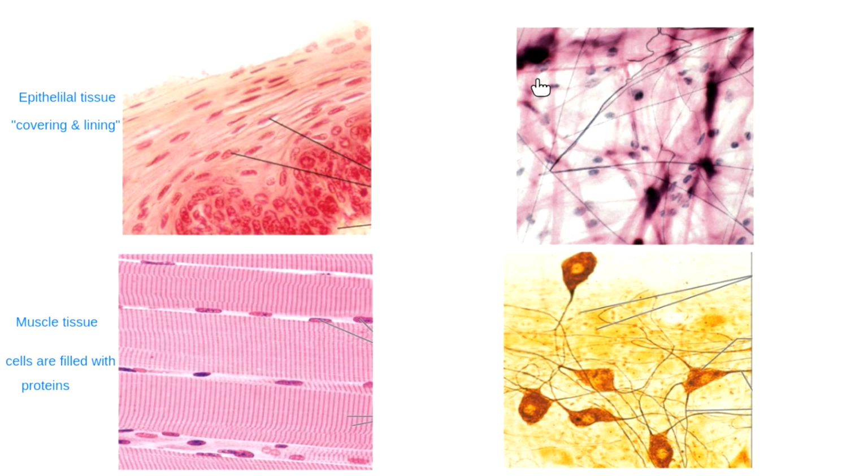The type of tissue that we're looking at over here is one example of what we call connective tissue.